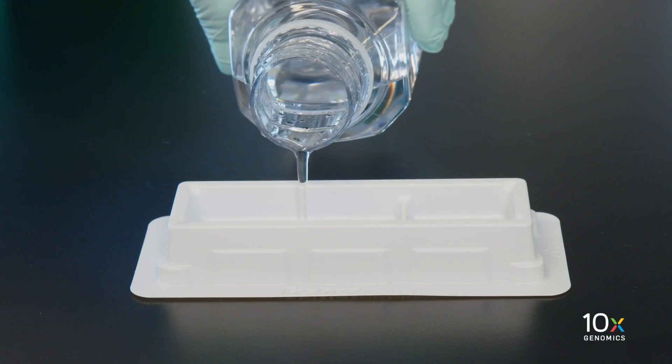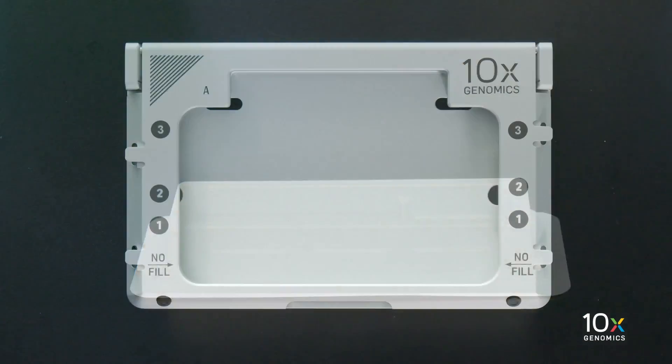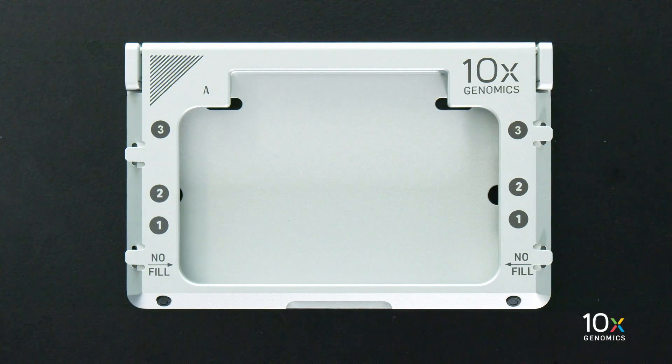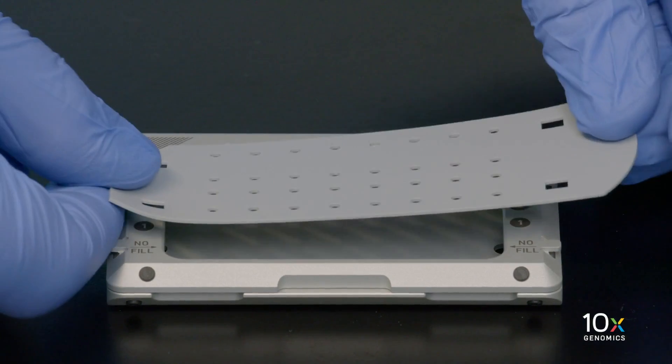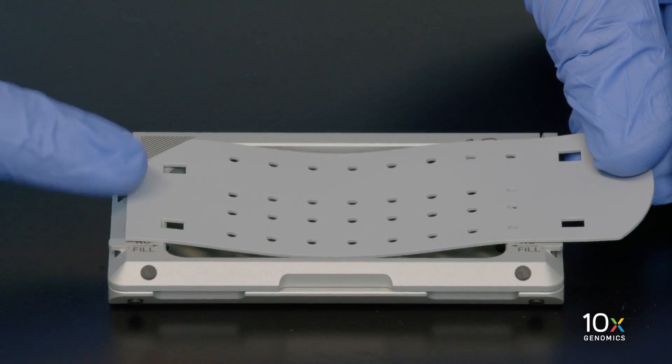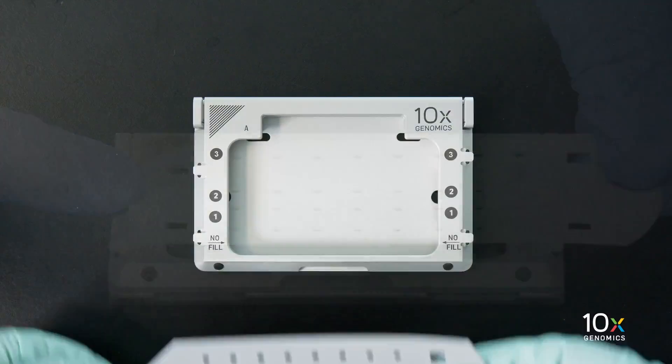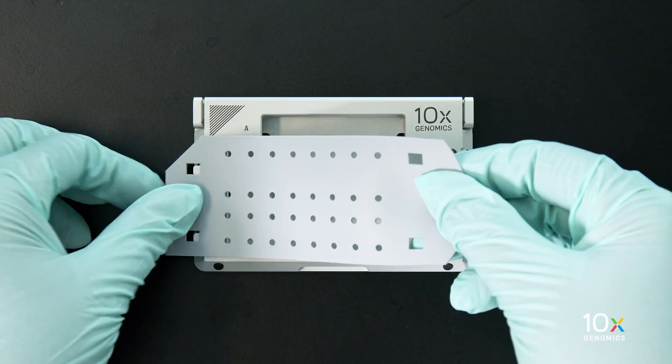We have combined the GEM master mix with the resuspension buffer and diluted samples. Now we will assemble the chip. We have 50% glycerol. Ensure the secondary holder is closed before attaching the gasket. The gasket attaches in only one orientation with the notch on the upper left hand corner.